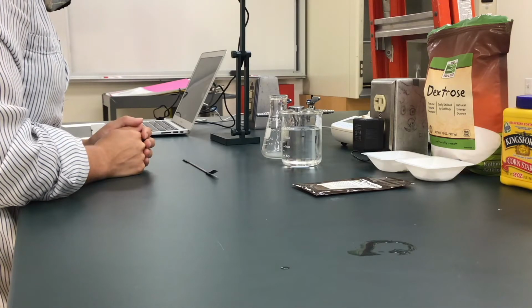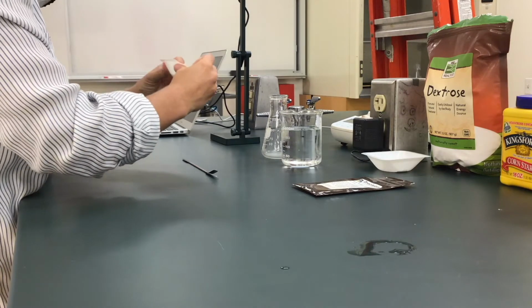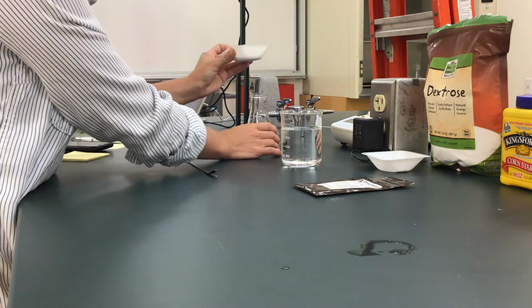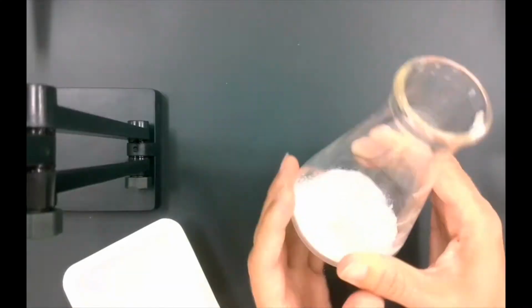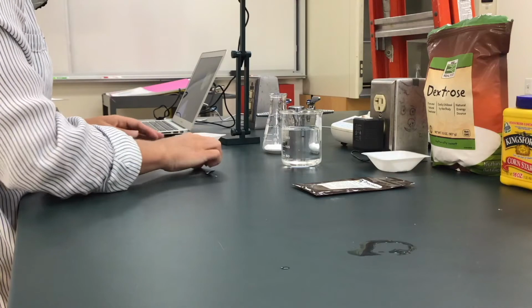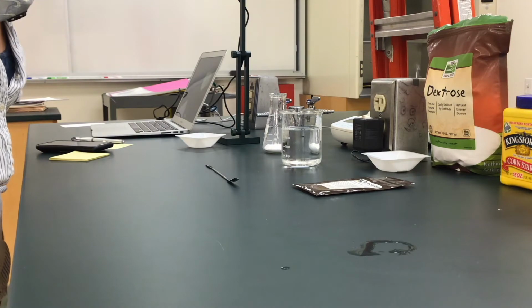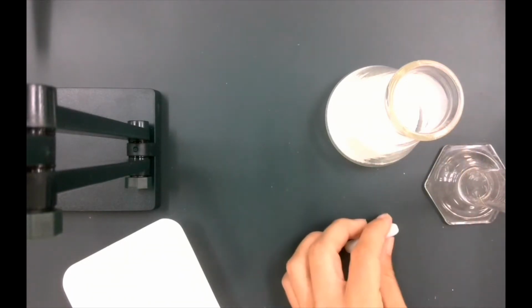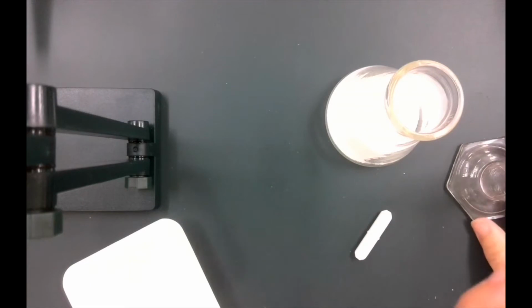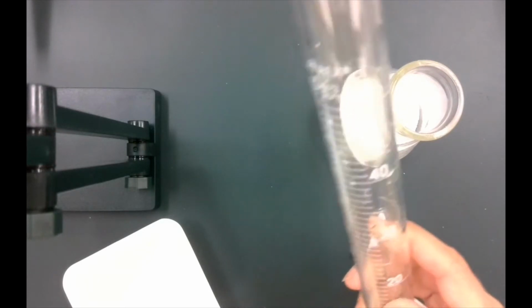And the first one I want to combine is the glucose solution. So I'm going to take our measured glucose, and then I need to measure out our volume of distilled water, and we're going to need 75 milliliters. So I'm going to measure out 75 milliliters using a graduated cylinder. This graduated cylinder can measure up to 50 milliliters, so I'm going to need to use it twice to get the volume that we need.